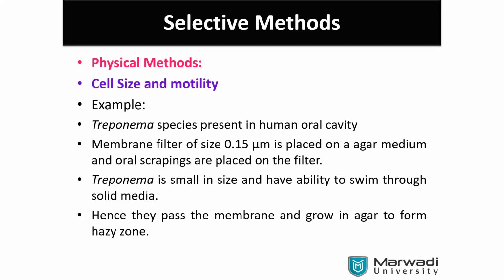See, like we are doing the culture of bacteria. Still, then we are able to see those features. That is the colony. Okay. The colony which starts growing, then we can study the micro. Yeah, good try to convince me, but it is not yet fully convincing. You can see a single one in a colony. Okay. I may take a skin cell, start to grow it on a plate, observing on a microscope. Is it a microorganism?